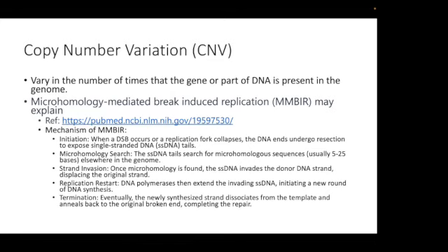But NGS is different. In NGS, we just align, and here is chromosome 1, first base pair position, and chromosome 1 goes all the way to the 250 million base pair position. And you just check how many reads are in that bin, and draw the histogram.